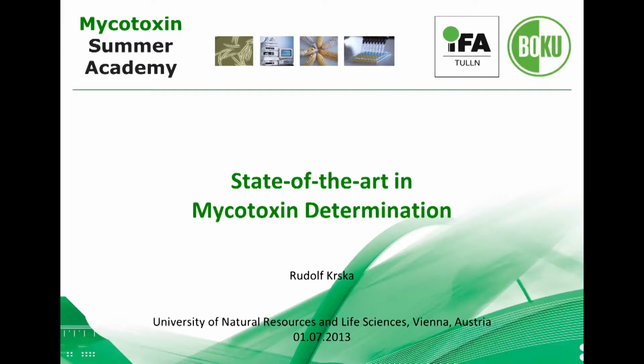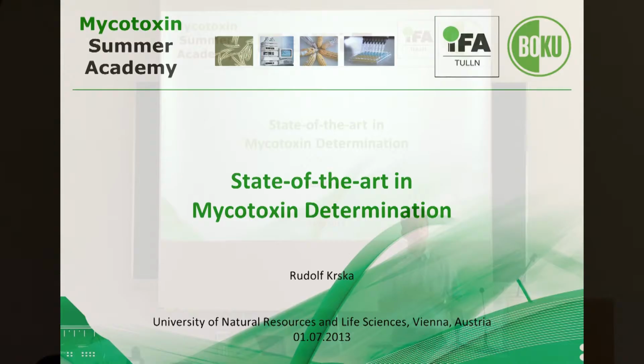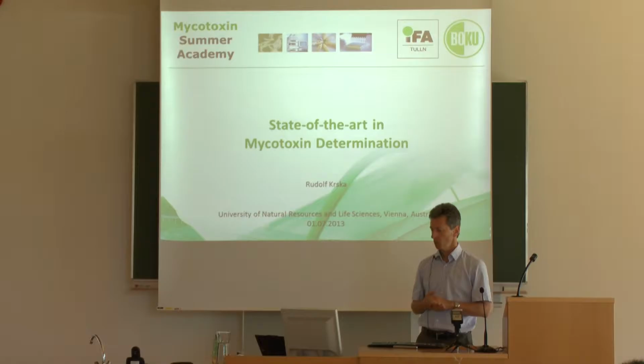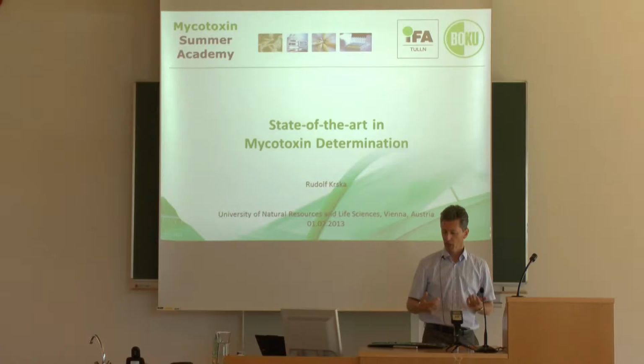This is about the state of the art in mycotoxin determination. As I said before, there are a couple of control and prevention measures to avoid mycotoxins, but in the first instance, you will have to look for the presence, whether these toxic secondary metabolites are there or not. And that's actually the purpose of my presentation here, to present to you the state of the art in the analysis of commodities for mycotoxins.